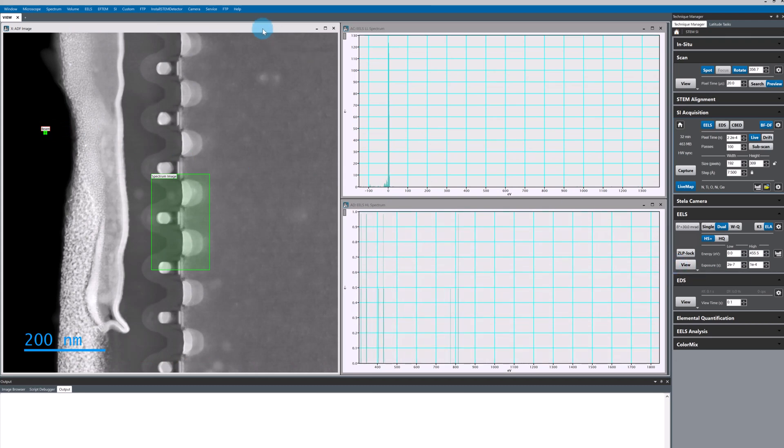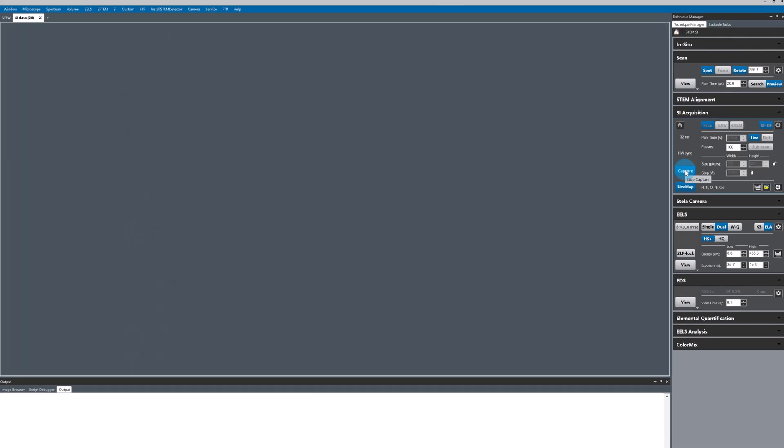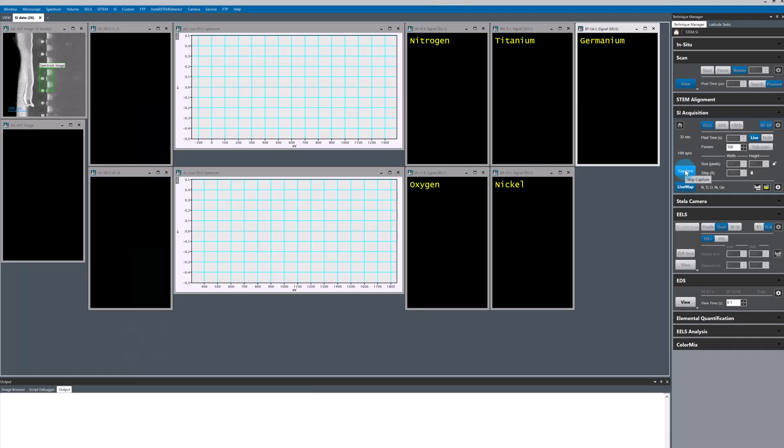I've already set up my 2D array spectrum image so all I need to do is click capture in SI acquisition.